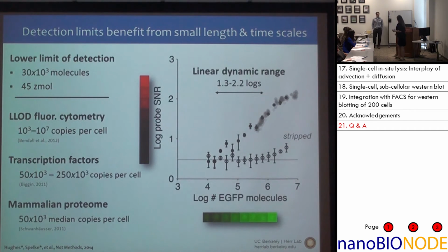Do you know what currently limits your limit of detection? The limit of detection right now is really limited just by the mass of material that's there and the readout technology that we're using, right? Certainly people can do single molecule detection. The question is, would you want to do that in a clinical facility? Probably not, right? And so for us, that's a matter of, instead of using just fluorescence readout, there's a lot of chemistries that can actually amplify the readouts and give you much lower sensitivity, which is better, right? And so some of those approaches are compatible with our technology, and are promising in terms of extending it.